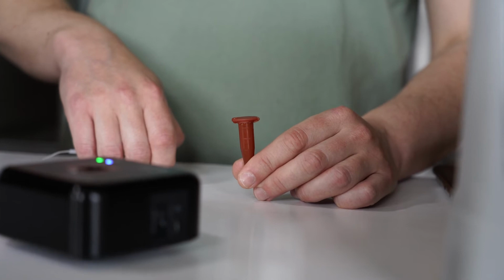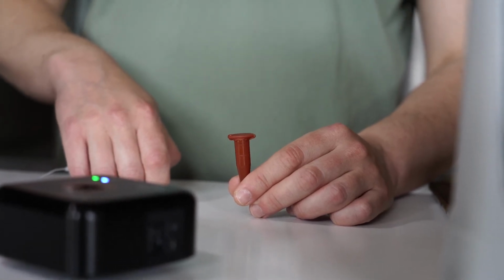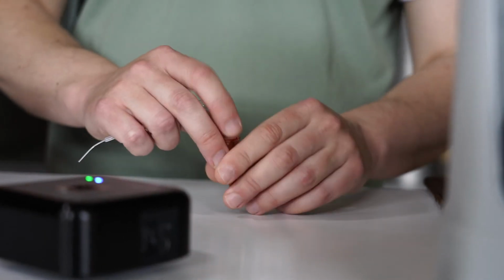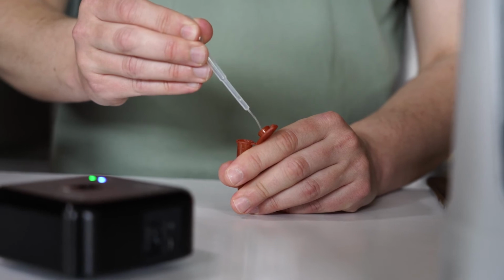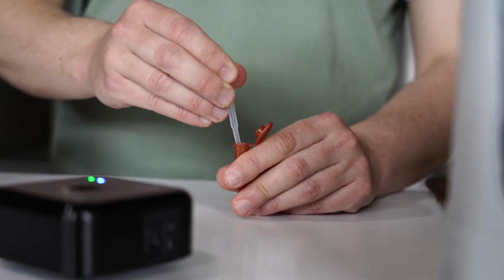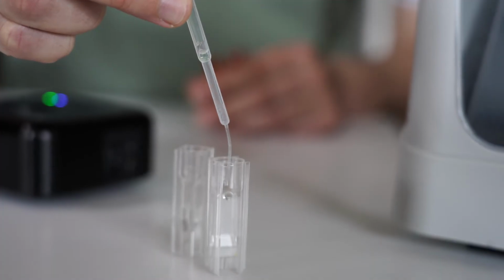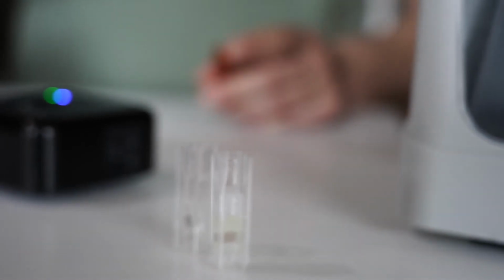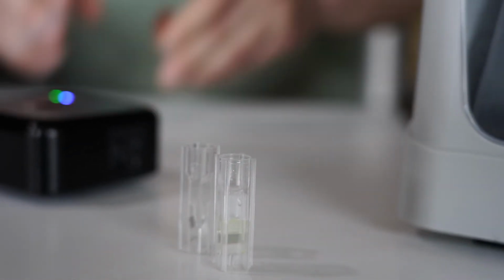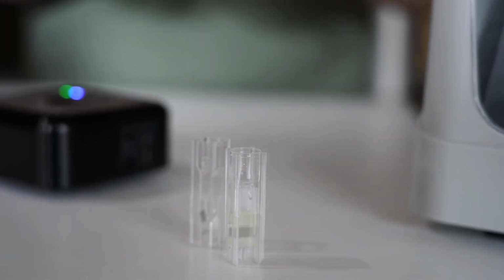So now we have the tube with the stopping reagent, and what we need to do is to transfer this into a cuvette. So we open it, and with the help of a Pasteur pipette, first from the lid, then from the bottom, we take the resulting liquid. And now we are ready to read this with our Series spectrophotometer.